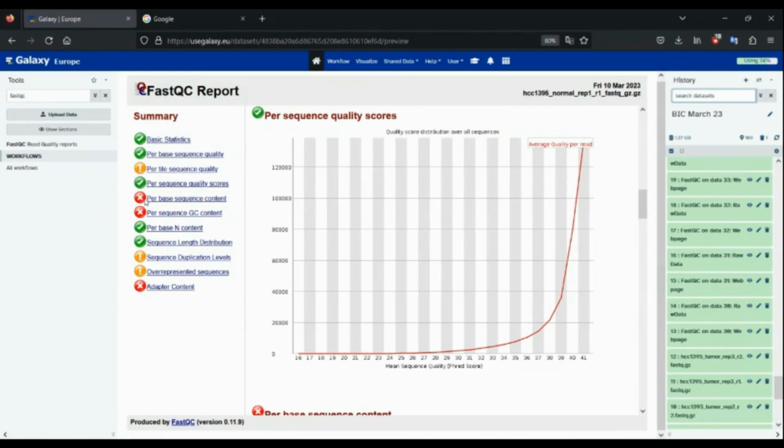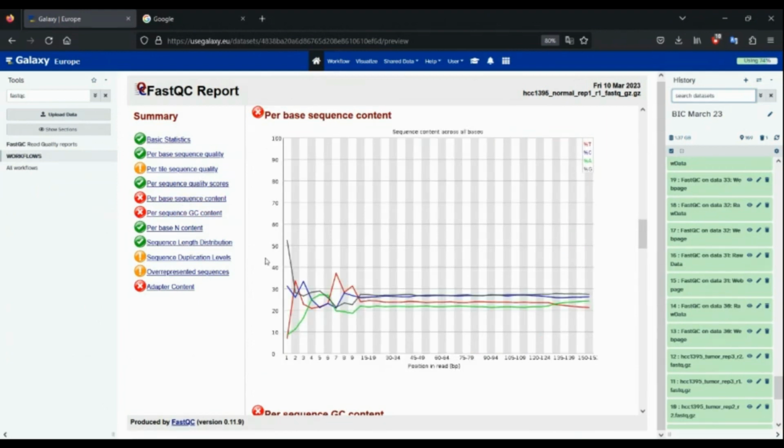Okay. Now let's take a look at the 3 outputs where the FastQC report says that we have failed those tests. The first one, obviously, as discussed during the workshop, is the per base sequence content. I already explained this to you. In the case of RNA-Seq, you don't have to worry about that, because I said the first 10 to 15 nucleotides will be quite erratic. So it's very close to 15, between 10 and 15. We're just going to leave this, nothing to worry about.